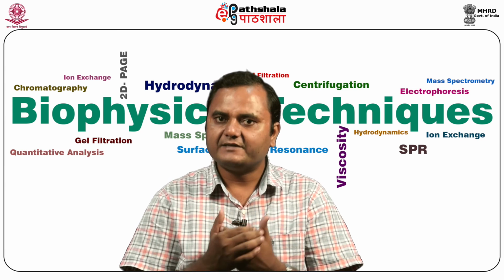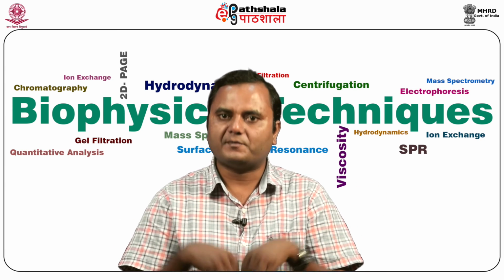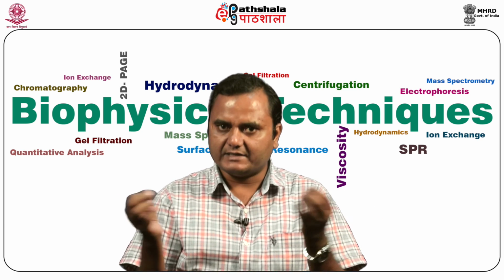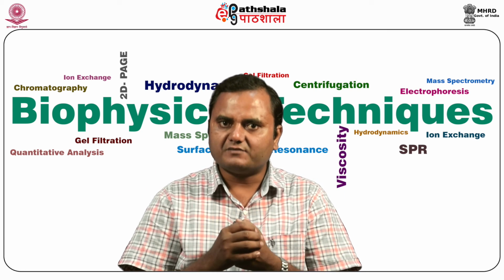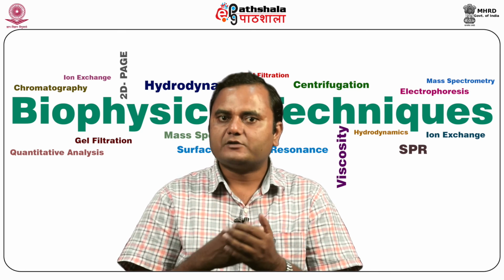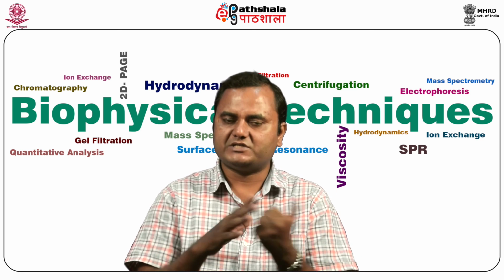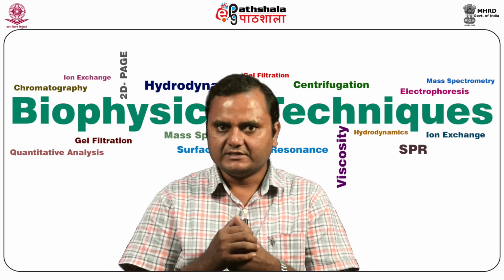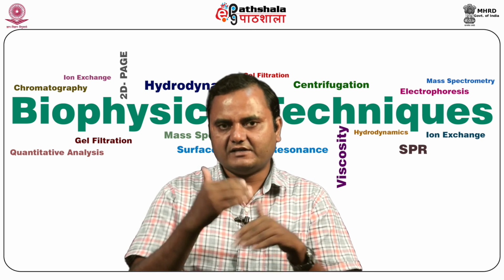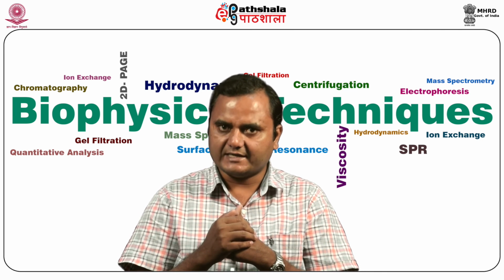In the same way, you can see how these monomers assemble together to form big complexes, what the stoichiometry is, and what the ratio of the molecules is that could bind together to form a complex. Then it also gives you the idea about the equilibrium constant for self-associating and dissociating systems. So these are very wide and most useful applications in biological science.